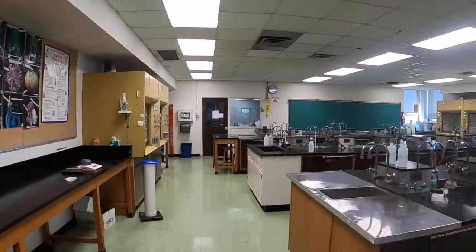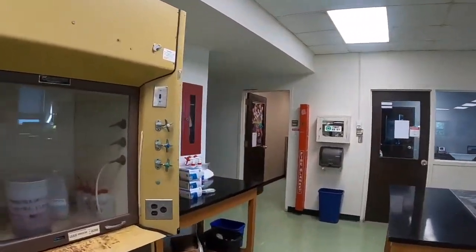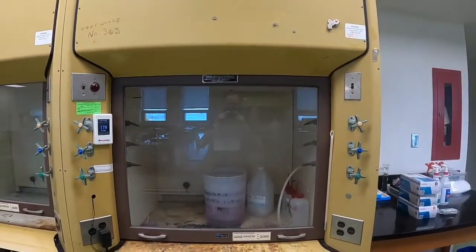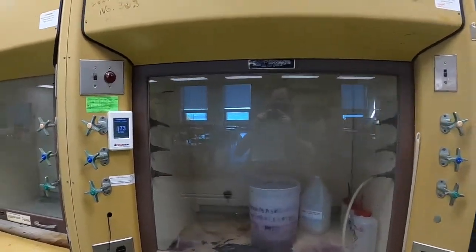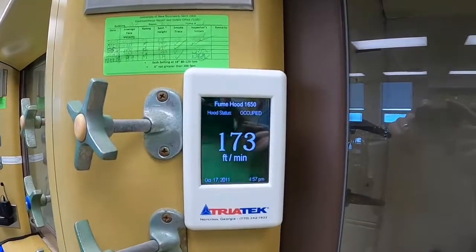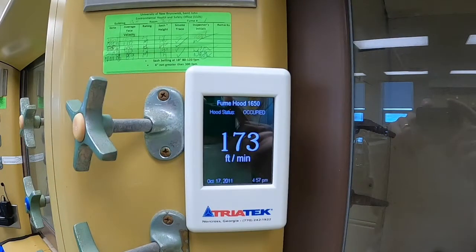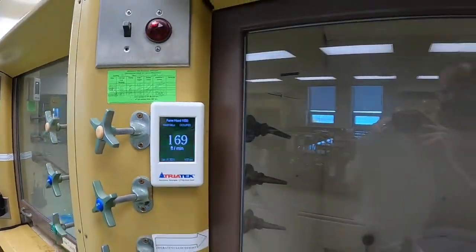Sometimes in the lab, you might be asked to work with something that either smells terrible or gives off toxic fumes, or both. In order to work with them safely, you use something called a fume hood, which is a large ventilated cabinet that draws the fumes away from the user. Fume hoods have a digital gauge that shows you the airflow rate. What's important is to only use a fume hood where the color displayed on the gauge is green.